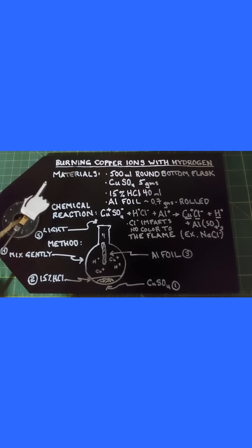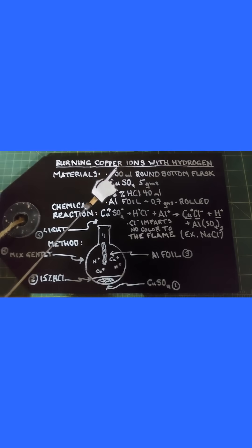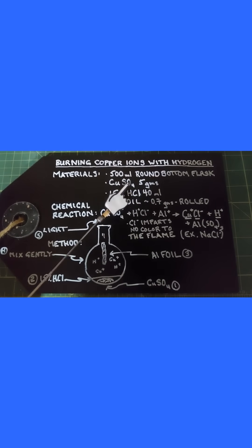We are going to look at a pretty unique reaction that's rather beautiful in this video. It's basically burning copper ions with hydrogen. For our materials we need one 500 milliliter round bottom flask, copper sulfate 5 grams.